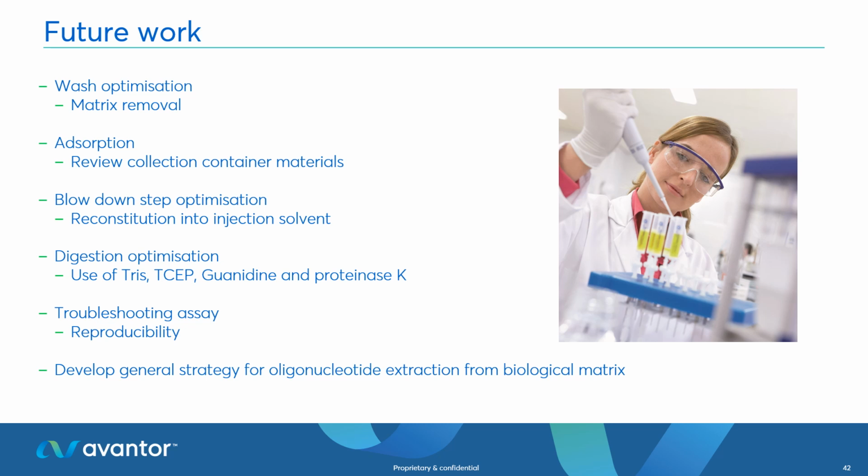Finally, once we've got the final method, we'll then have a look at troubleshooting. And the idea behind all of this is to develop a general strategy. So not a unique method, but a general strategy which can then be applied to the analysis of oligonucleotides from a biological matrix.